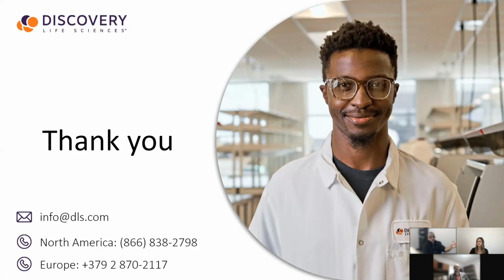We do not use any traditional column-based prep. I'll say this on this call, we don't use AllPrep. I think the standard protocol is pretty much the AllPrep, very much widely used in the industry out there. The plot that I was showing was the standard prep and the optimized prep: AllPrep versus using the Covaris technology. And we found that back in 2016.